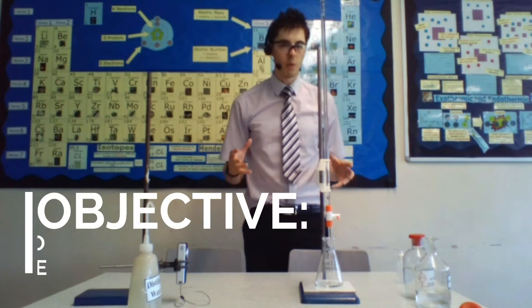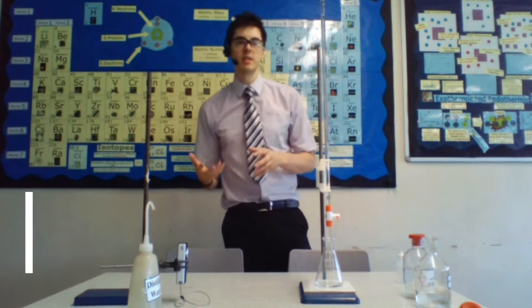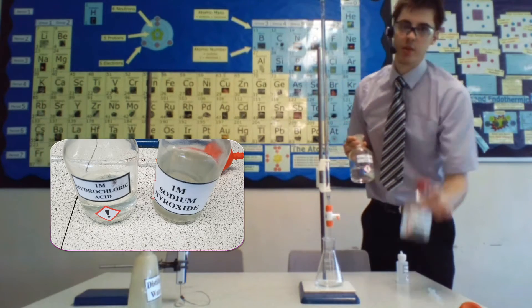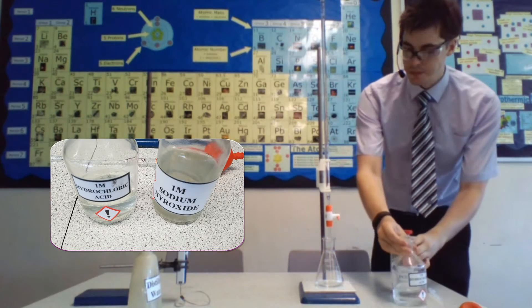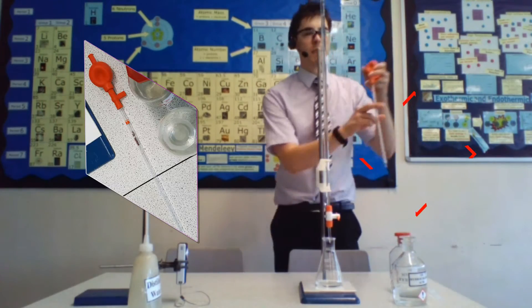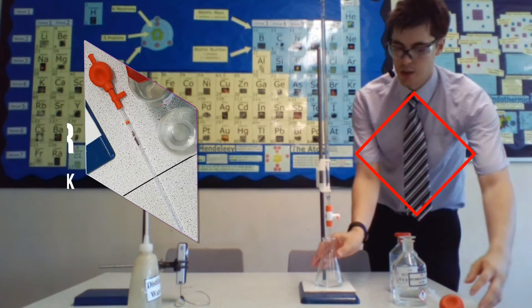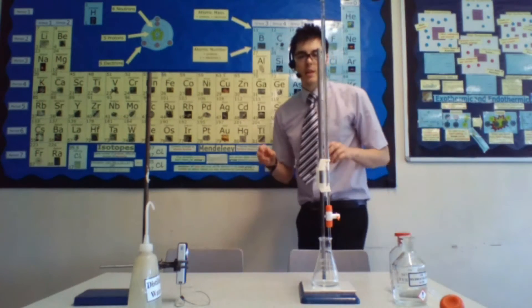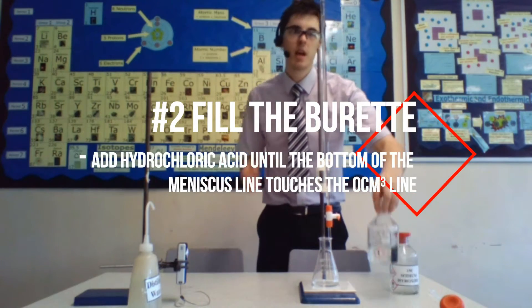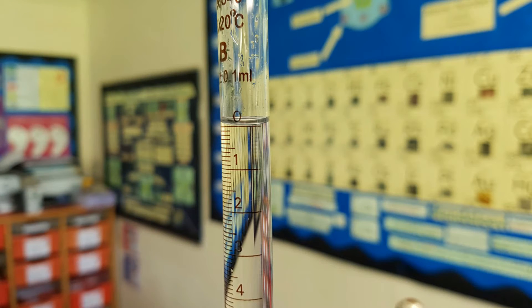What we want to be doing here is a titration experiment to find out how much acid it takes to neutralize 10 ml of sodium hydroxide. First, get yourself a pipette filler and measure out 10 ml of your sodium hydroxide into the conical flask. Then fill up your burette with hydrochloric acid so the bottom of the meniscus is on zero.